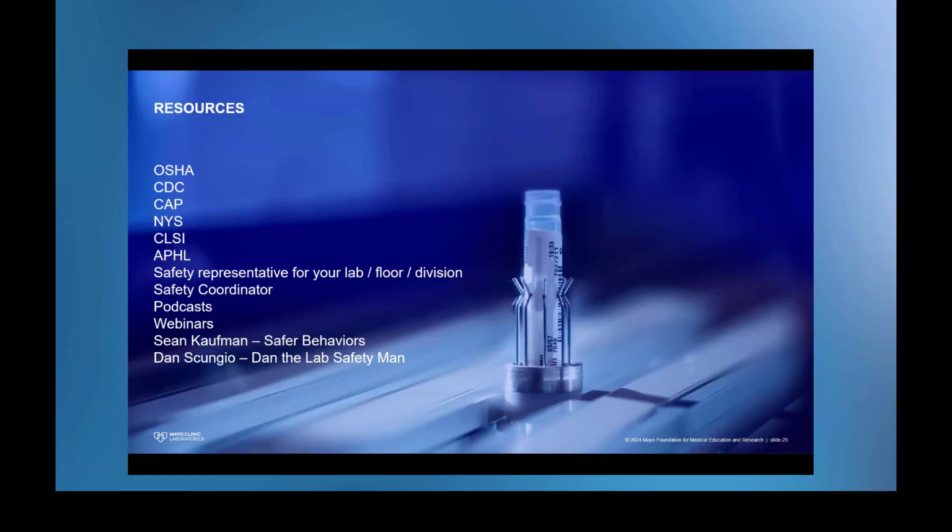A few things. I don't know if any one is particularly helpful above another, but having your leaders come to the laboratory and see if you've posted the data about, for example, compliance with appropriate footwear or compliance with safety glasses, and they have the opportunity to commend that. Who doesn't love a pat on the back or a job well done?